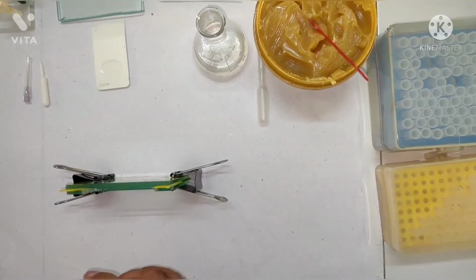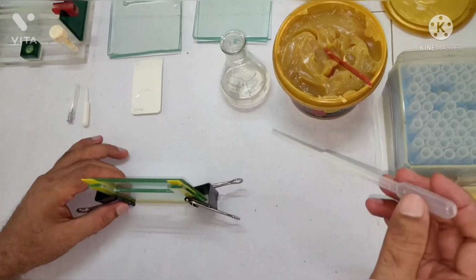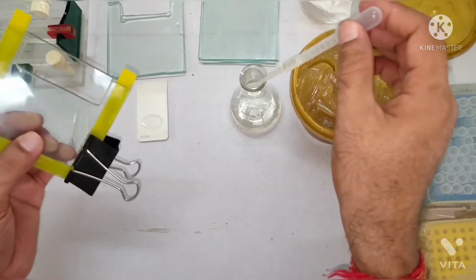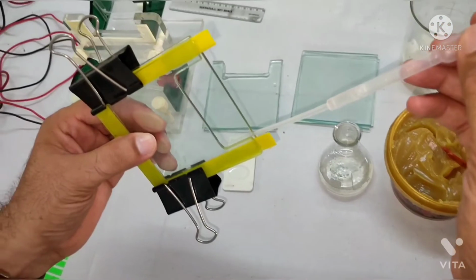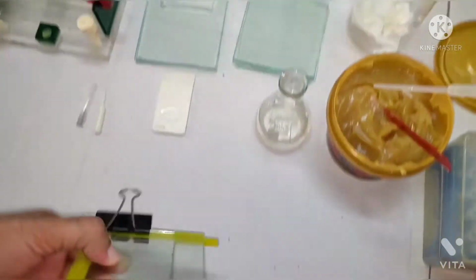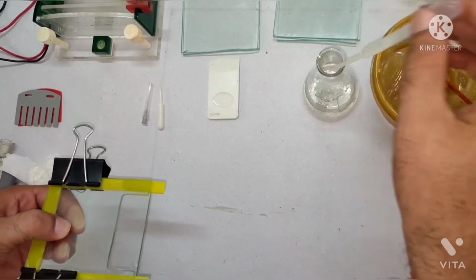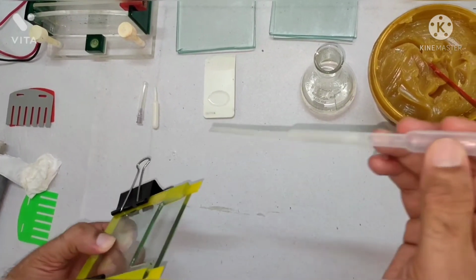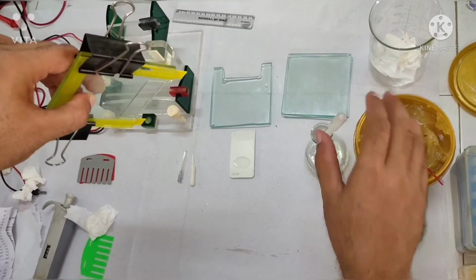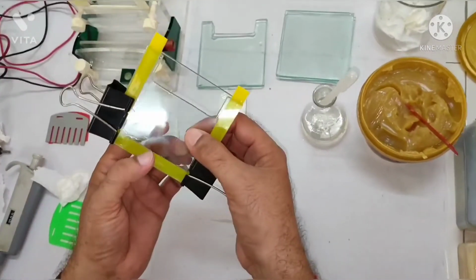Like this. So now this plate is ready, but if you cast your gel in this plate, the chances of leakage are there, right? So to prevent the leakage, we seal this with the 1% or 0.8% agarose, right? So this is the agarose. You just put agarose and then to the side of this one, see, like this. Okay, we'll take some more amount of agarose, right? Just you run the 1% agarose, it will become sealed automatically. See, like this. See, this is the agarose and this is just sealing, right? So we sealed. This is almost sealed.